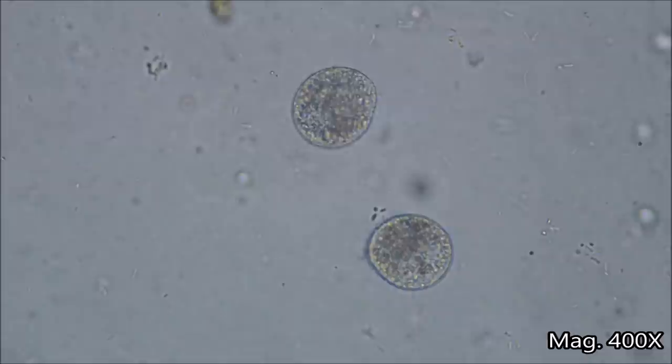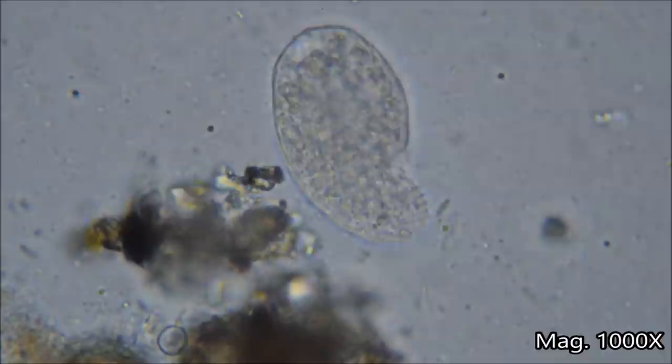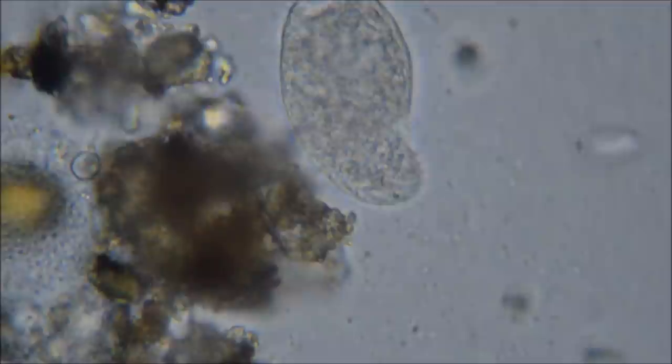These microbes are called ciliates, which is a diverse group of protozoa. They get their name from the tiny, hair-like structures on the surface of their cells called cilia. They beat their cilia to help propel them and create movement. They can also beat their cilia to manipulate the fluid around them.